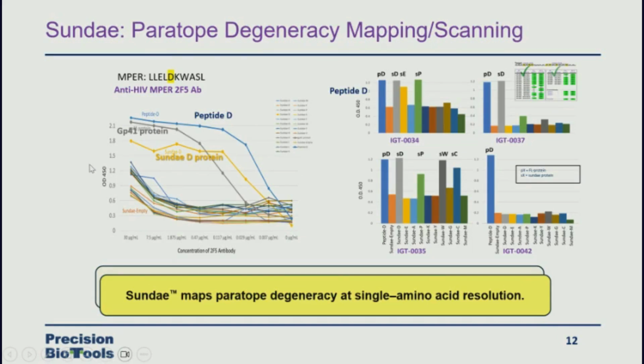This is 20 flavors. So at a particular site in an epitope, for example, in this case here, we're looking at this Env sequence from HIV, this aspartic acid. We want to know what else do the antibodies that we've isolated against it recognize.